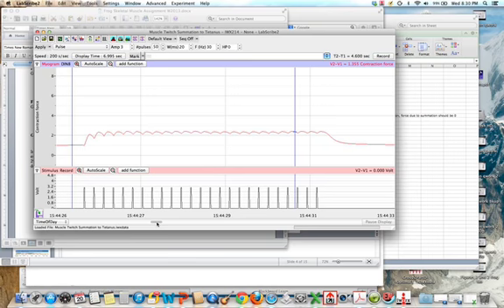In this case, you're looking at the summation due to tetanus, and what you're going to want to do is place this between the last two peaks. And this will give you an idea of how much summation has actually occurred over the course of the entire stimulus paradigm. And so there's our cursor there, and there's our cursor there. Note that this cursor is not here, and it's not here. It's right in between the two. And so that tells us, and that's 1.2323. And so you can note what that is.